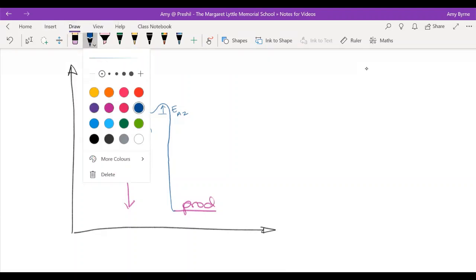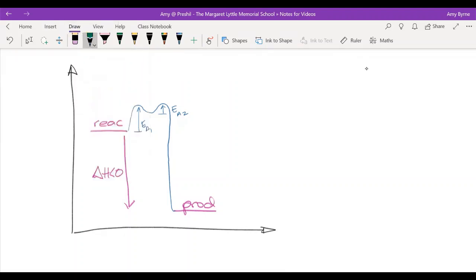Now we get into more detail with stepwise reactions in HL. But the thing to note is that this guy here, this activated complex, this is where cobalt 2, which is pink, becomes cobalt 3, which is green. So let's go back and watch that demonstration, because you will see the point at which that pink cobalt 2 becomes this really lovely sort of emerald green cobalt 3.